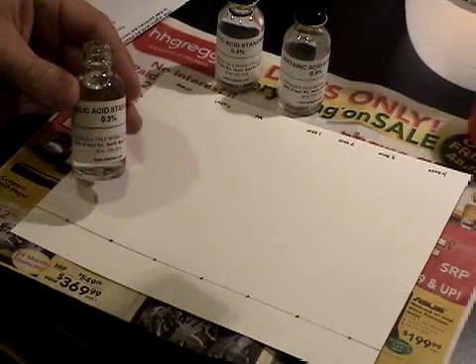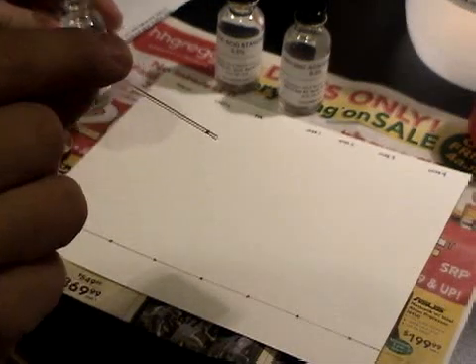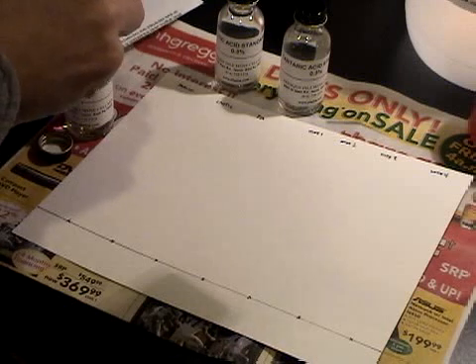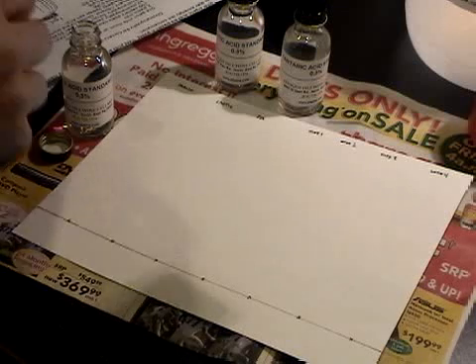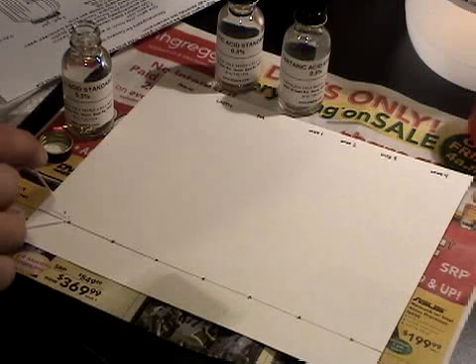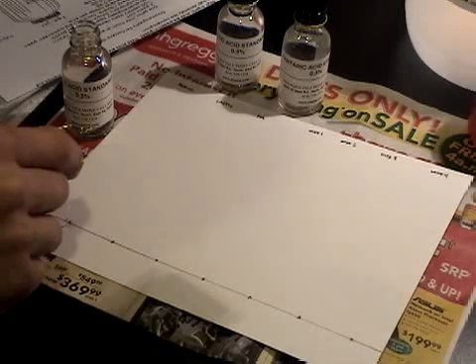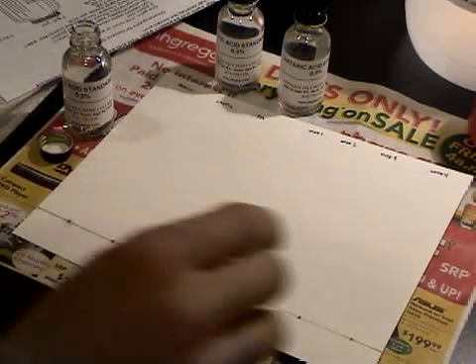The first one I'm going to do is the malic acid standard. I'll take the capillary that they give me and I'll fill it up just to the line that's marked. You can use a paper towel to kind of dab it out to get it a little less. When you touch it to the paper you want that standard to soak into the paper and have approximately a quarter inch in diameter sample. Use a different capillary for the next acid.